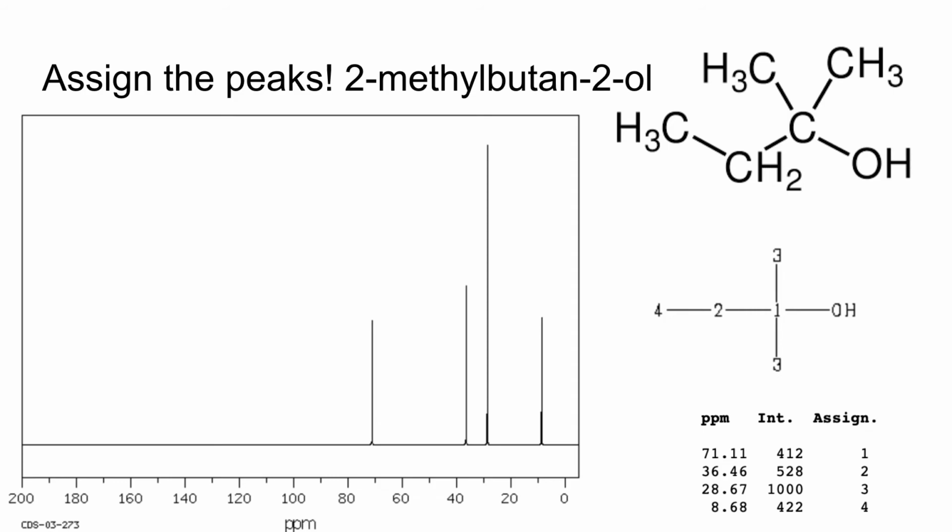But what we've done, without looking at the table that we used last time, was intuit the positions of peaks based on how shielded or deshielded they are, just by thinking about what the structure looks like and how they're influenced by the atoms around it. Great job. That's awesome. So that table is kind of useful, but you don't need it now.